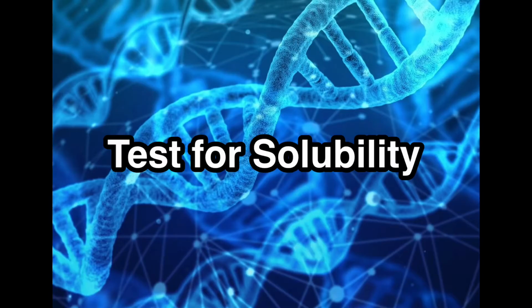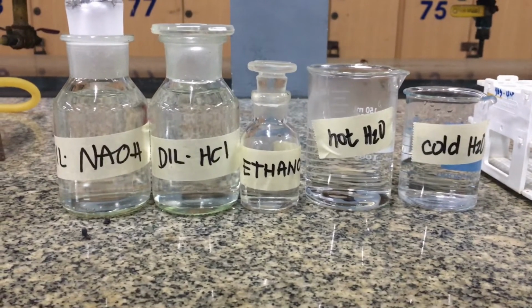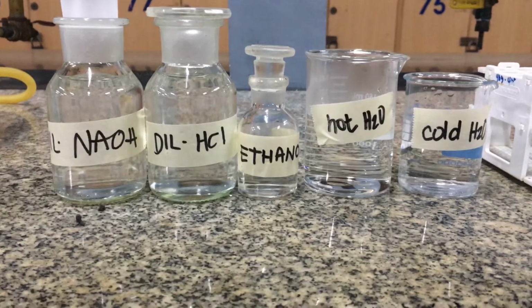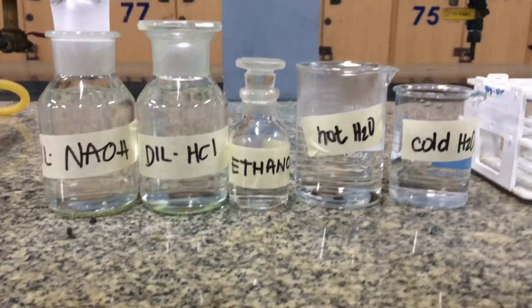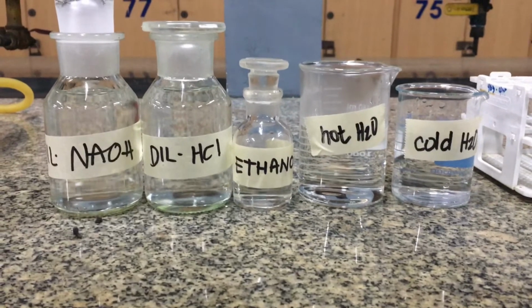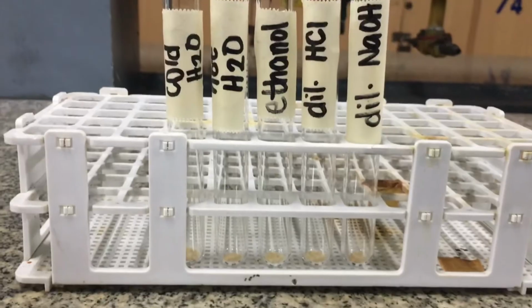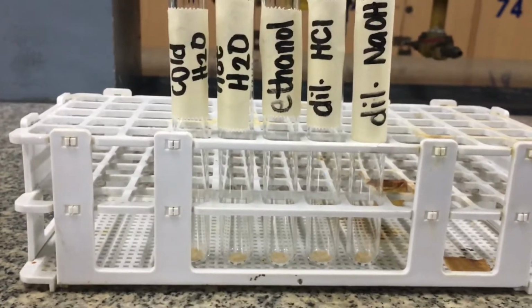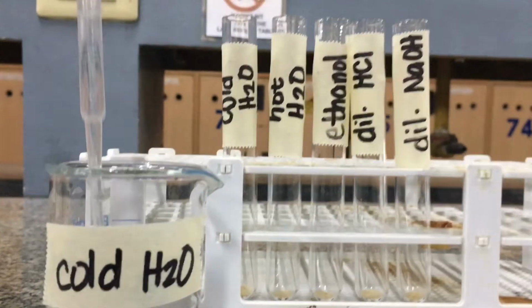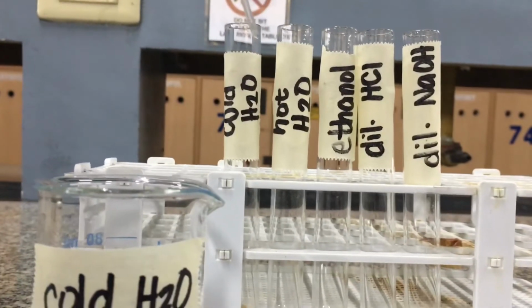Let us start this experiment by testing for the solubility of RNA in different solvents. The solvents that we will be using for this test are cold water, hot water, ethanol, diluted hydrochloric acid solution, and diluted sodium hydroxide solution. To do this, place a pinch of yeast RNA in 5 separate test tubes, and then add 2 ml of each solvent to the corresponding test tubes.